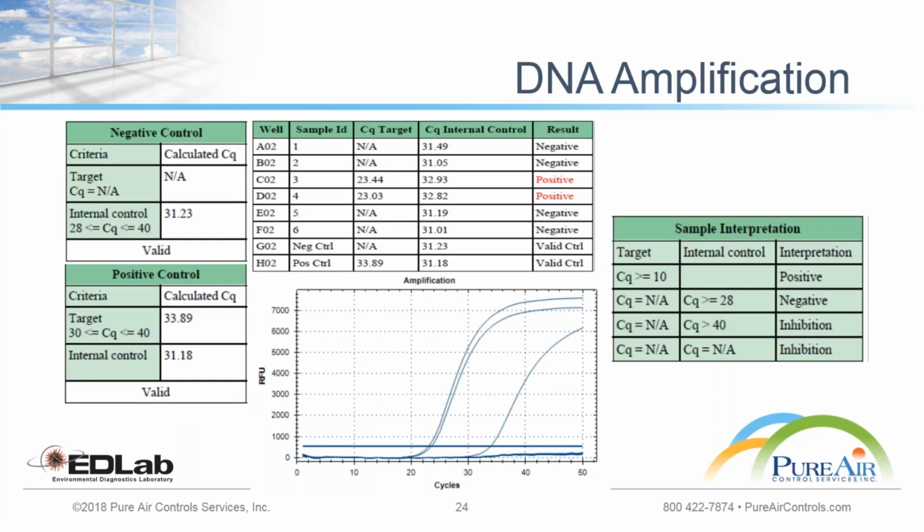As you can see, in the DNA amplification method, the gene is being multiplied. In this slide, we put a control, and against the control, if a sample contains a similar kind of gene, it is going to run exponentially and give us the standard curve versus their concentration. That's how we find out whether water is containing the DNA of the Legionella or not.